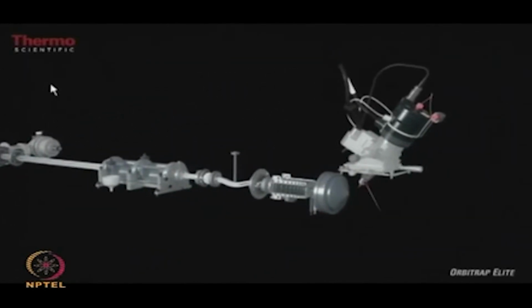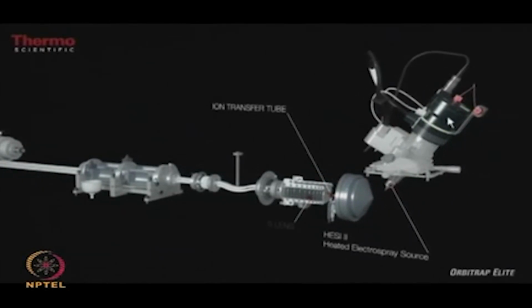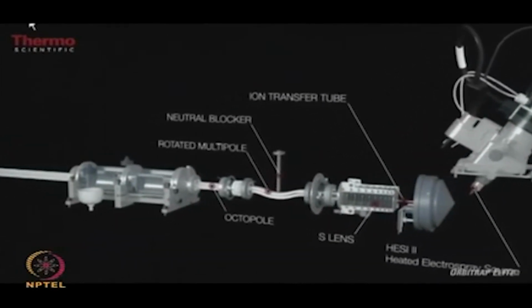If you look at the schematic of the system, in the front part is the ionization source which sits at the front. Then you have the transfer optics, and in the transfer optics we have the S-lens, which is the newest generation of transfer optics.